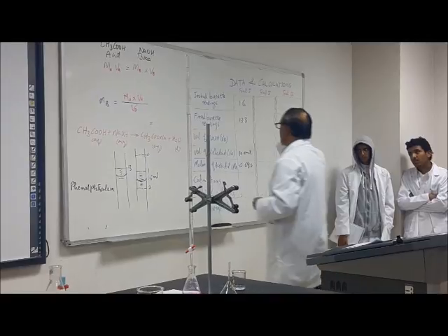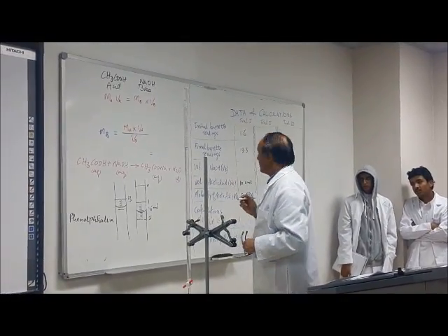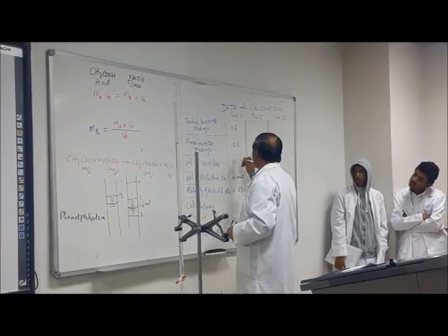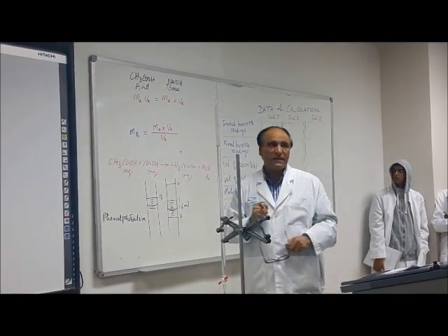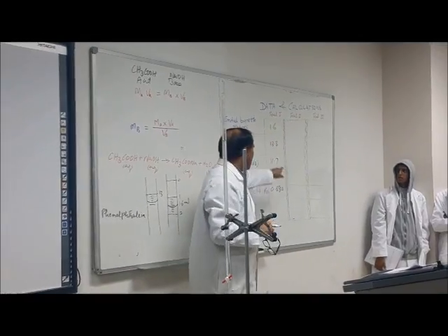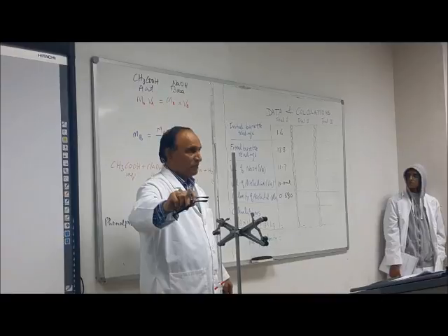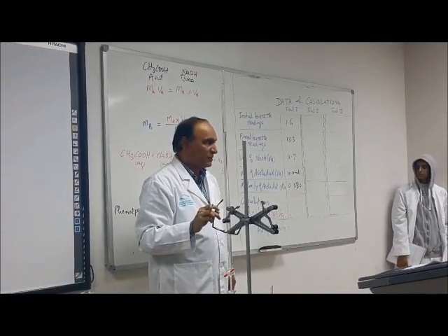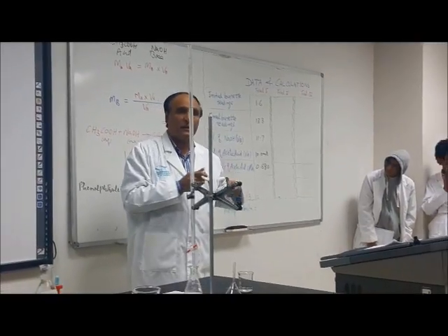How much is the difference? 11.7. This is the volume of the sodium hydroxide I used, right? The volume in milliliter.